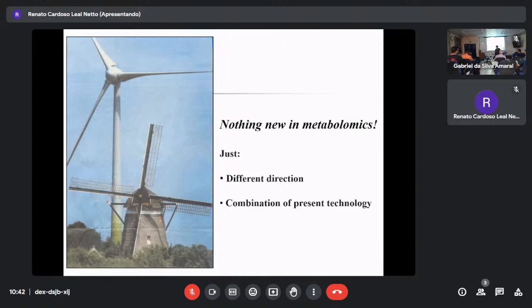That's why I gave you the first one. The second one is sample preparation, extraction. You have to take out the sample from the matrix so they are ready for analysis. So there is extraction work, whatever sample preparation you need. The conclusion is that depending on the sample, you have to optimize your extraction strategy.